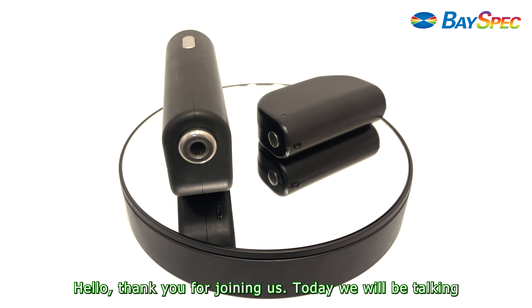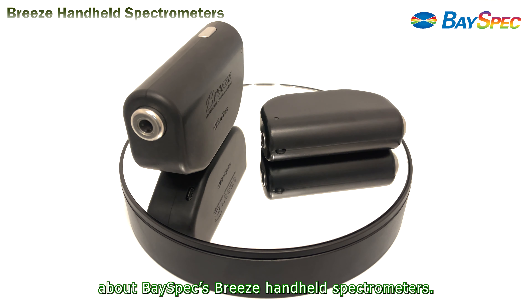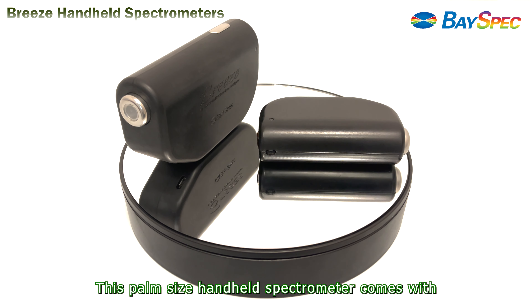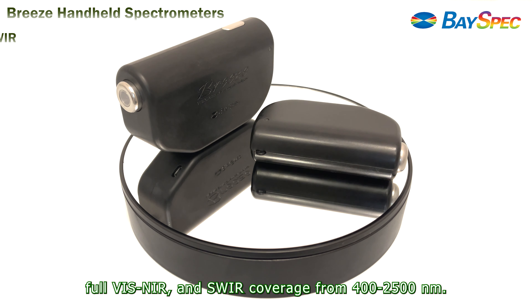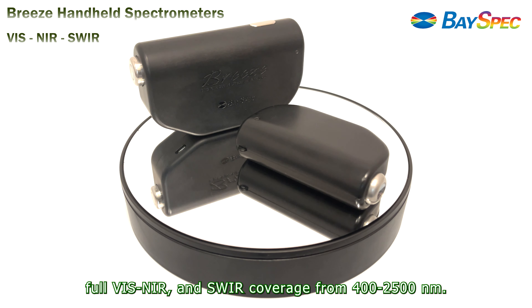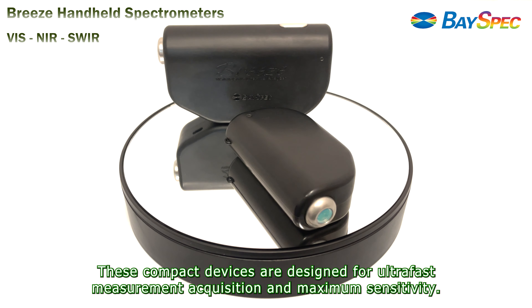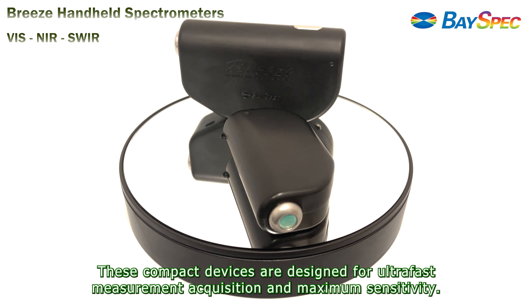Hello, thank you for joining us. Today we will be talking about BaySpec's Breeze handheld spectrometer. This palm-sized handheld spectrometer comes with full visible, near IR, and SWIR coverage from 400 to 2500 nanometers. These compact devices are designed for ultra-fast measurement acquisition and maximum sensitivity.